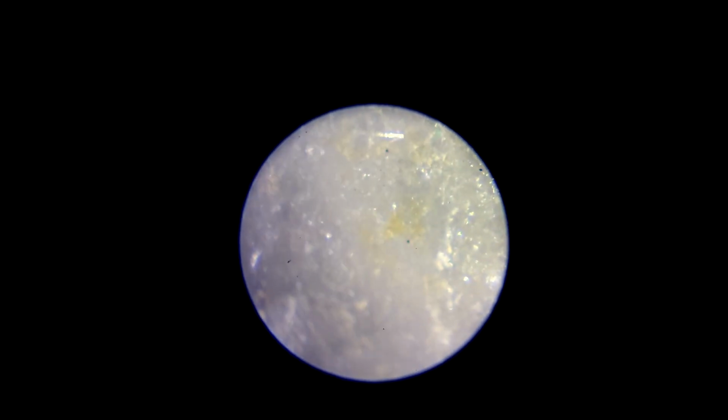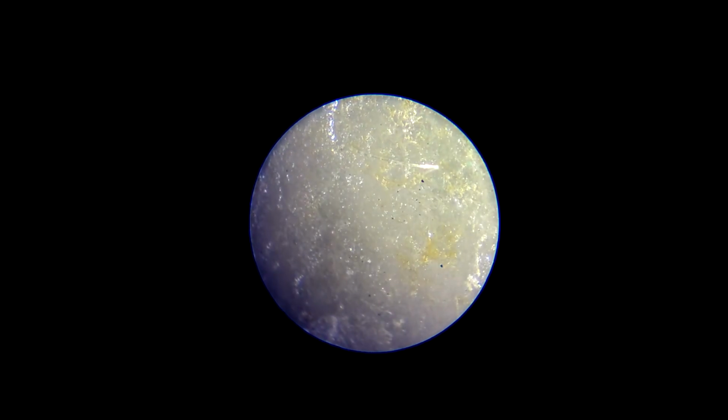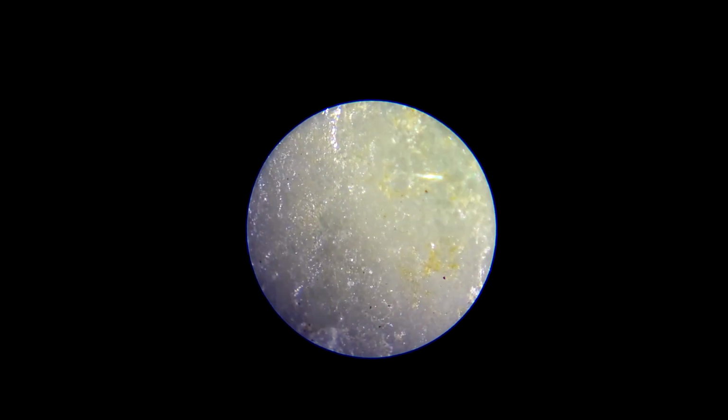Alright, let's go look at the standard sample. This is the standard sample at 60. And as you can see, it's much less flat and doesn't have any real edges. Let's go to 120. While you might not be able to see it on camera, I do have depth perception on this and can see that this is not a flat plane that we're looking at. However, when we zoom in, we can still see that there's no real edges.